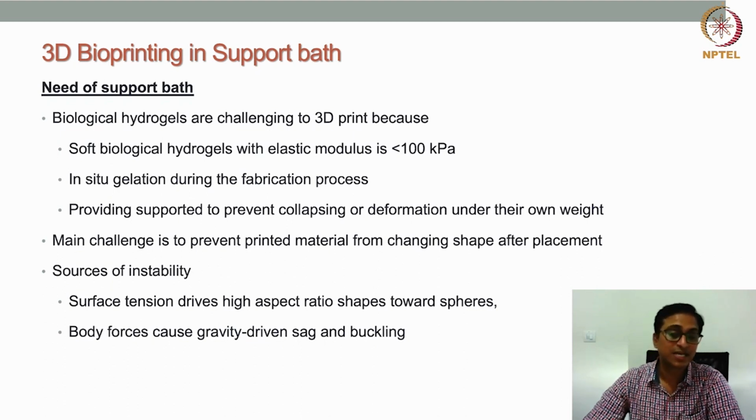The elastic modulus of those hydrogels is mostly less than 100 kPa. So with these very soft biological hydrogels, 3D printing is a real challenge.